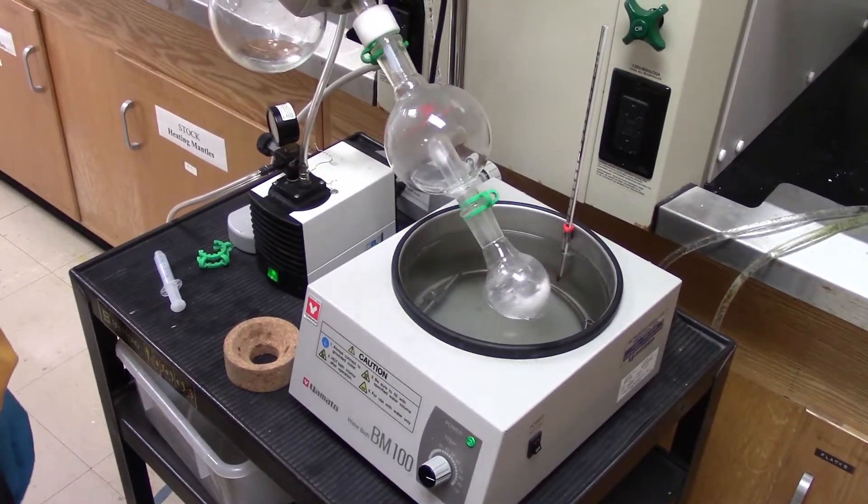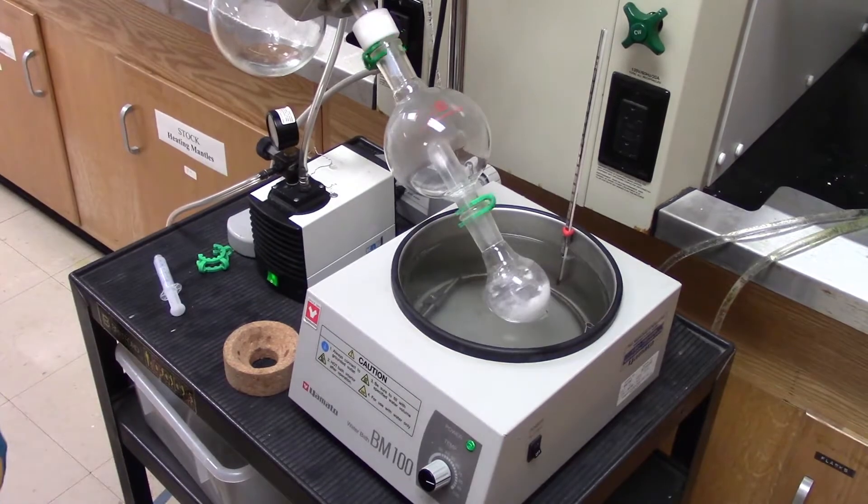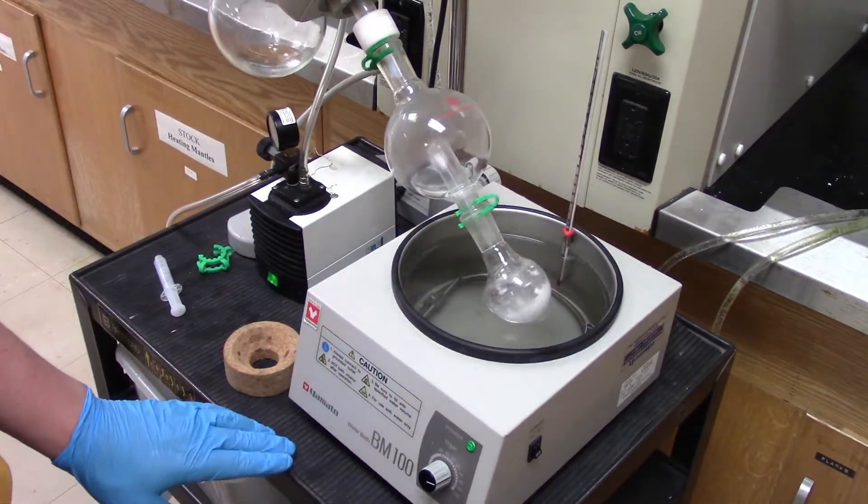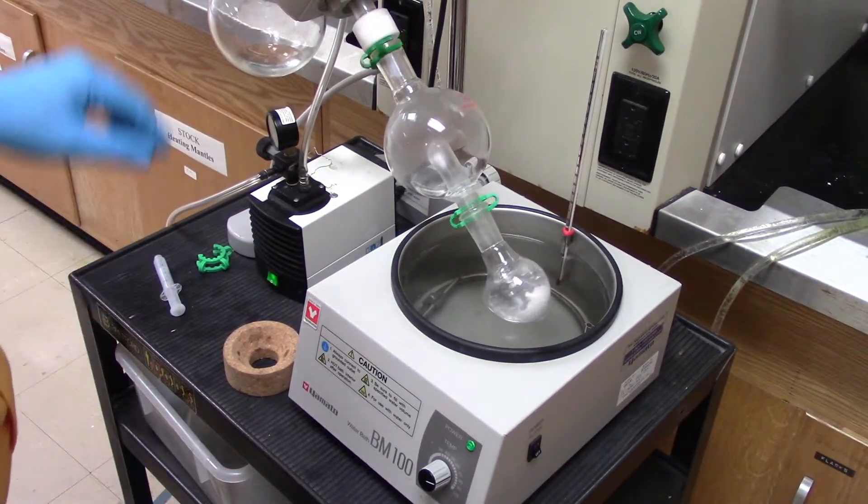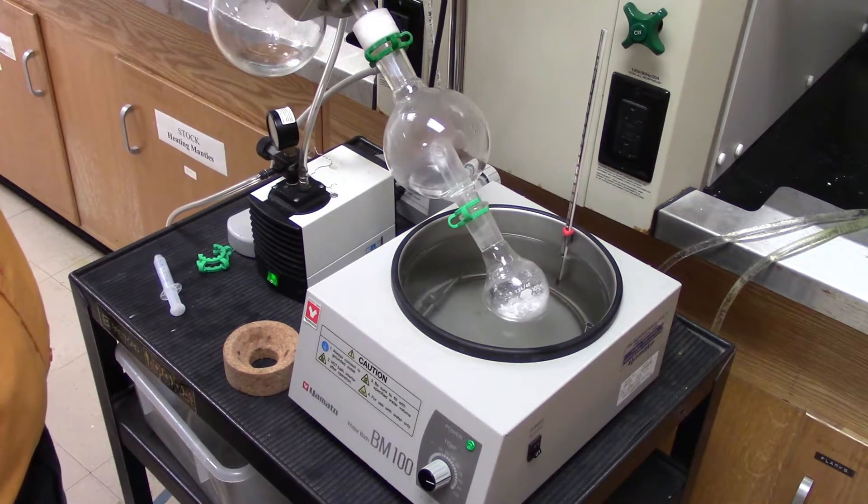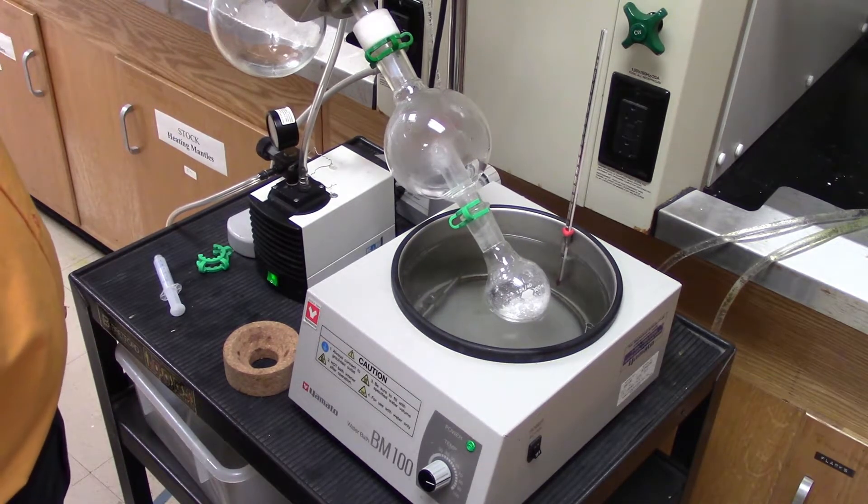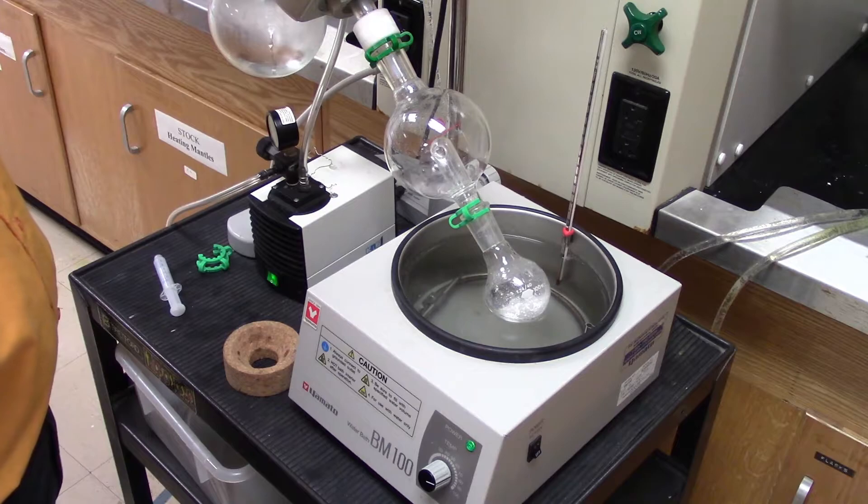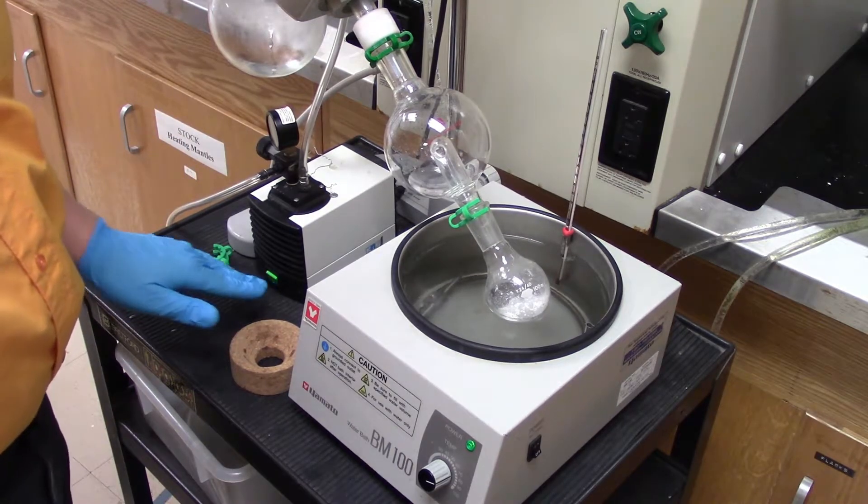Alright, so I let my rotovap run to completion here. And what you can see sliding along is the pure white acetanilide with a little bit of aniline impurity. So what I'm going to do is I'm going to stop the rotation, open up the pump, open up the valve, turn off the pump.